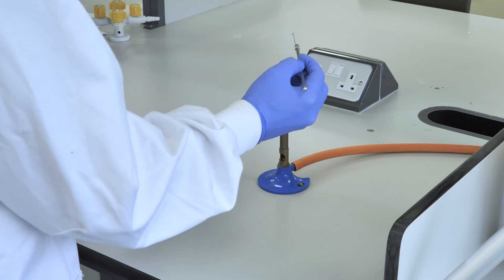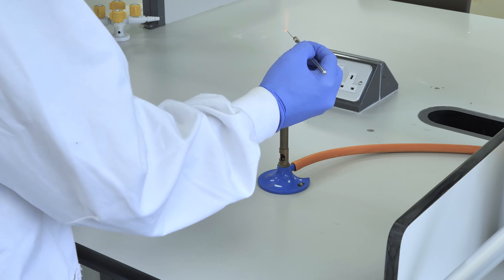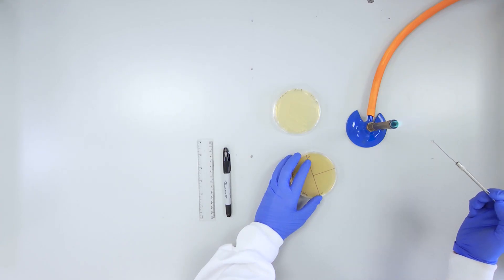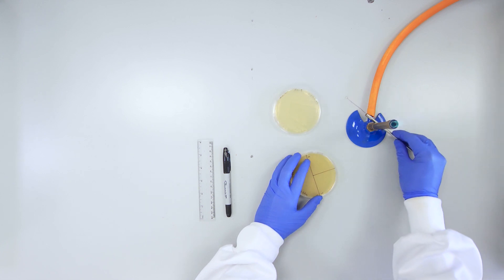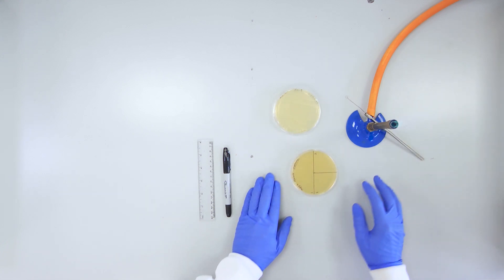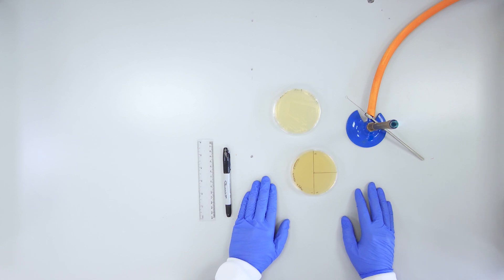Before you put your loop back down on the bench, make sure you re-sterilize it by placing it into the flame. It can now be left down and you can be confident that there is no bacteria remaining.